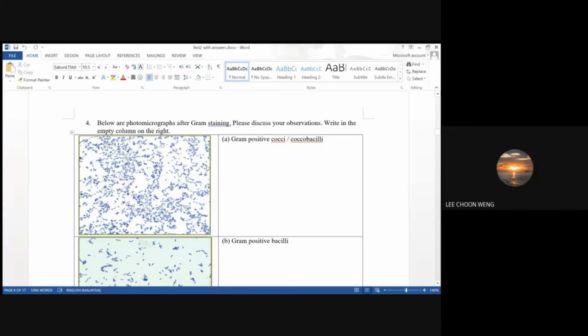Yeah, center. Okay, so you can play with this provided the colony is big enough to make a difference. Whereas if you're doing gram staining, then you prefer fresh cells, so you take from the edge. Okay, but most of the time the bacterial colonies are too small to make a difference. Okay, this is a point.